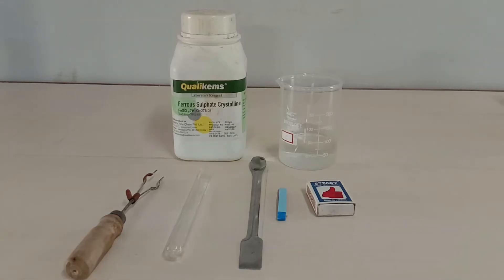Hello scientific audience. Today I'm going to demonstrate the decomposition reaction of hydrated ferrous sulfate salt. This decomposition reaction will lead to the formation of sulfur dioxide, sulfur trioxide, and brown-colored Fe₂O₃, which we commonly call rust. We are going to test the presence of SO₂ and SO₃ with the help of litmus paper.